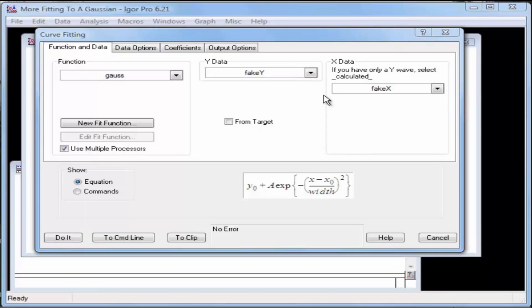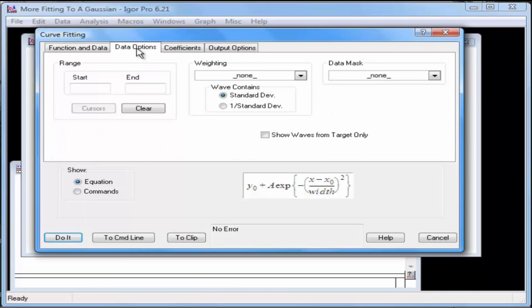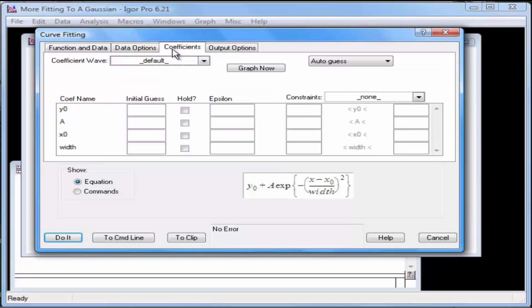Click the Data Options tab. The Weighting and Data Mask pop-up items should read None. Click the Coefficients tab. The coefficient wave should read Default, and the pop-up menu should read Auto Guess.